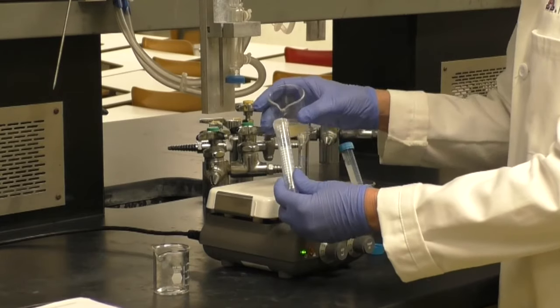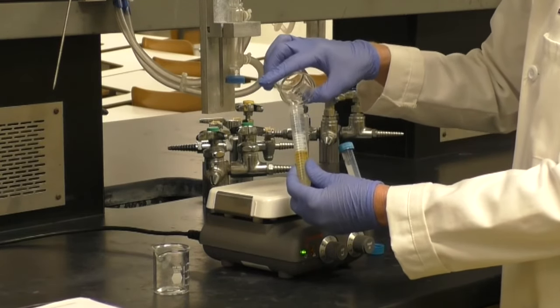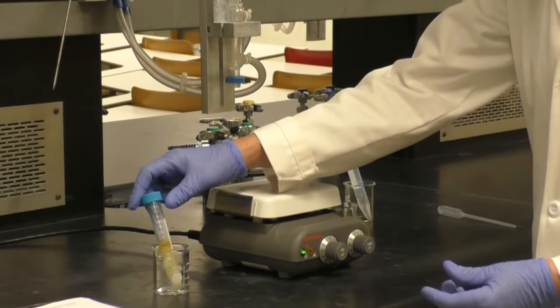Pour that solution into another clean, dry, 15 mL centrifuge tube. Place it in a beaker and allow the layers to separate.